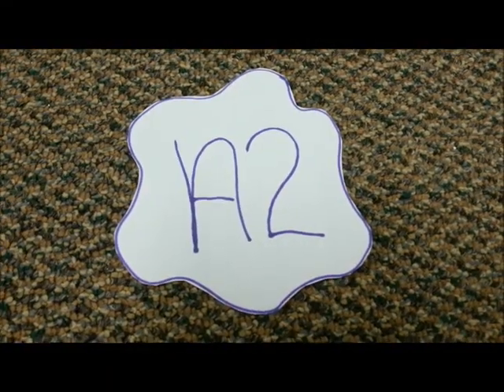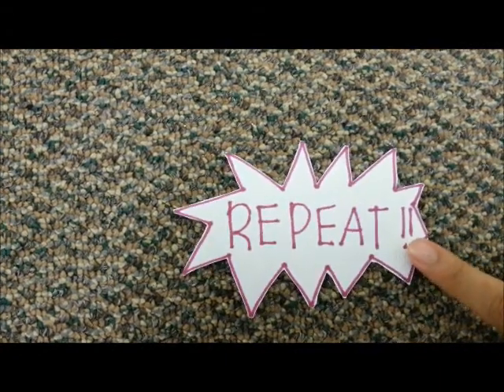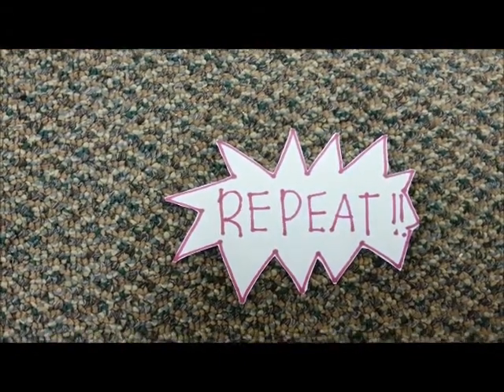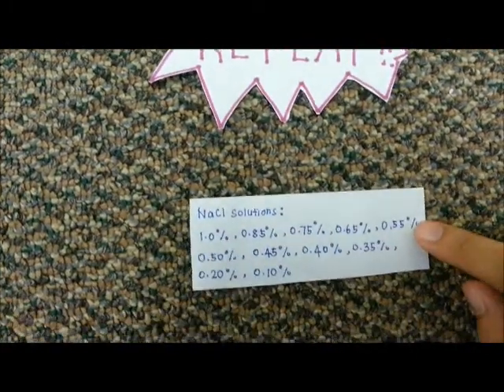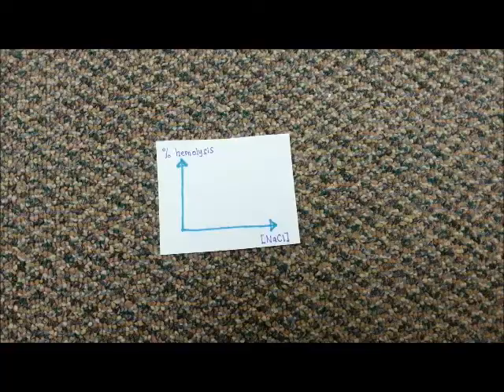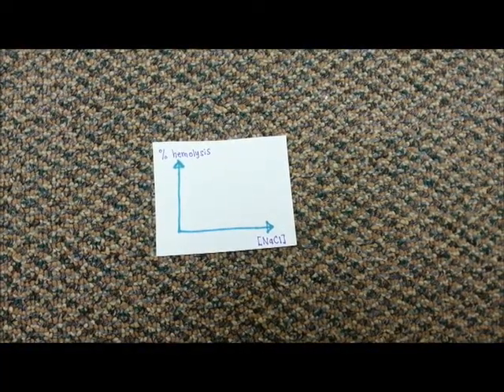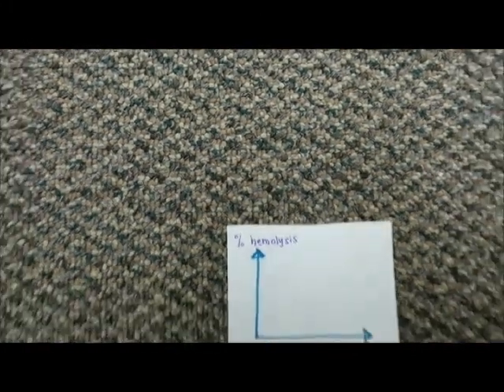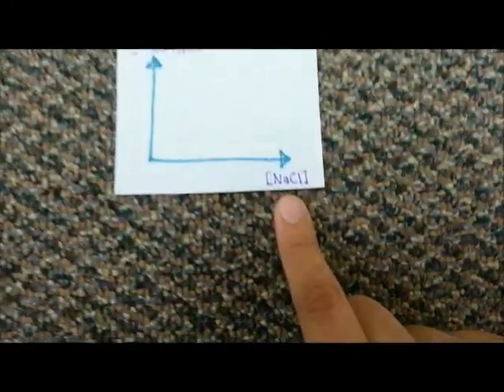In section A2, repeat all the experiment with the same procedure as section A1 by using sodium chloride solutions with different percentages. Plot a graph for the percentage of hemolysis versus sodium chloride concentration.